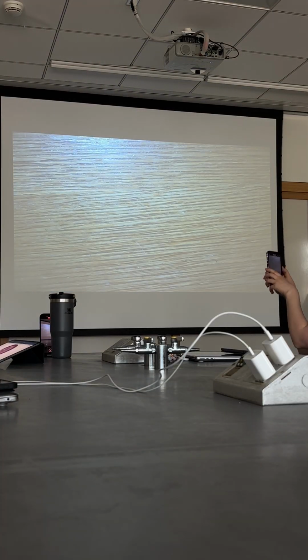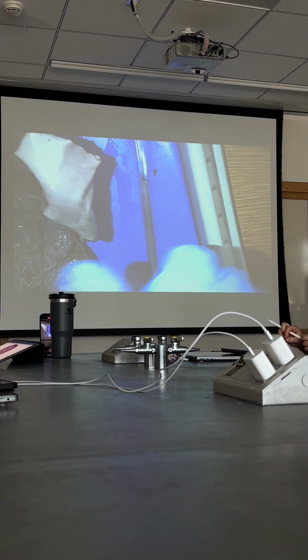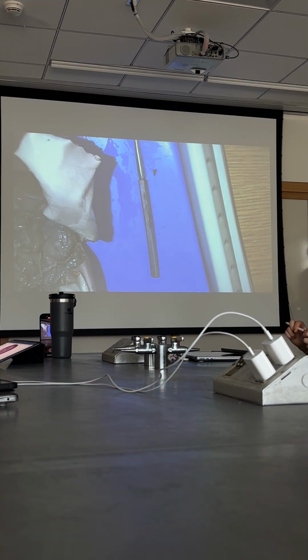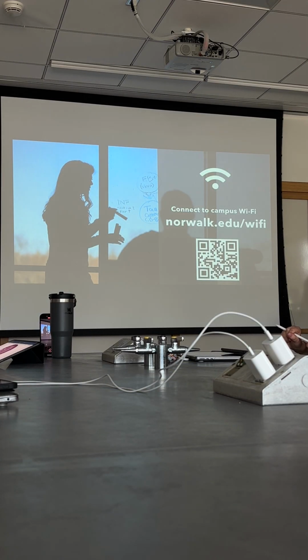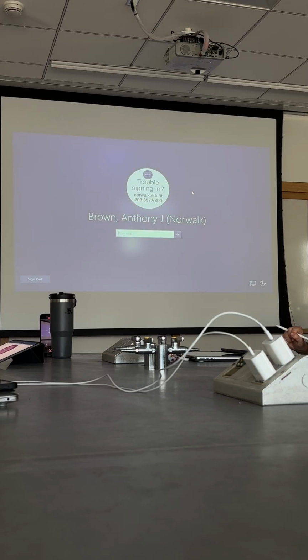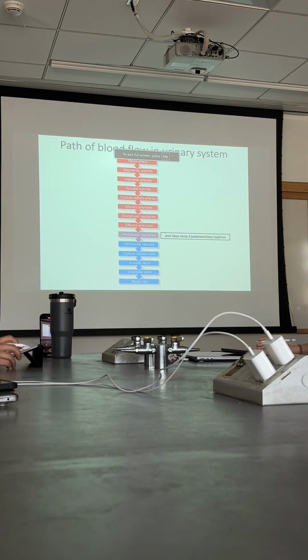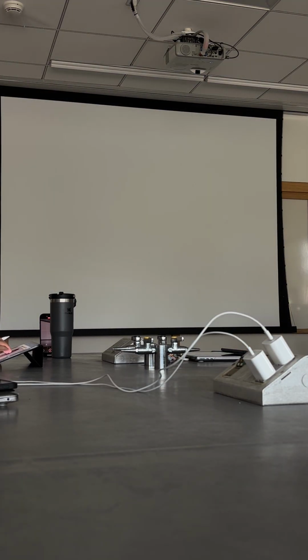Now let me do the microscope slides. Oh, it locks me out. Okay, we covered that.